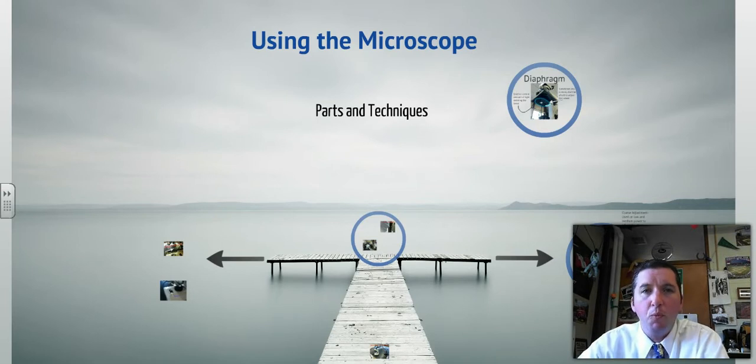So what you're going to be doing here, guys, today is we're going to be going over the microscope, going over the parts, some techniques, some things you may not have gone over before, and these are things that we'll be using together in class.